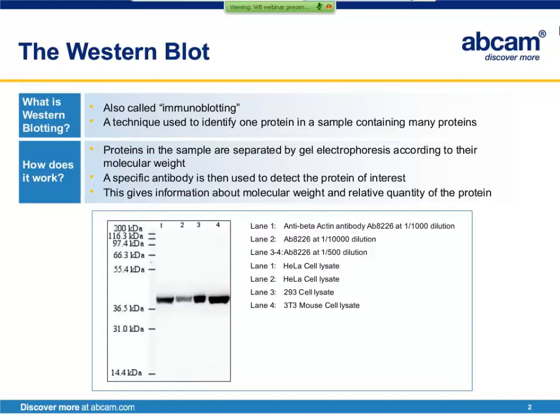For example, in this Western blot image, you can see that the band of interest, which is the control protein beta-actin, is around 38 kilodaltons when compared to these proteins of known molecular weight, which are run side-by-side with our samples. In lane two, less antibody was used to stain this particular sample, and so the band appears fainter than the others.